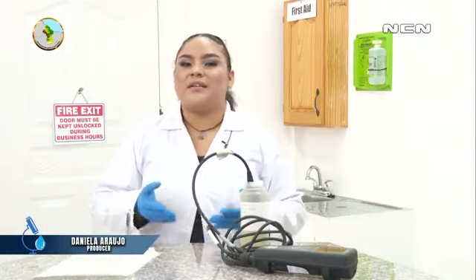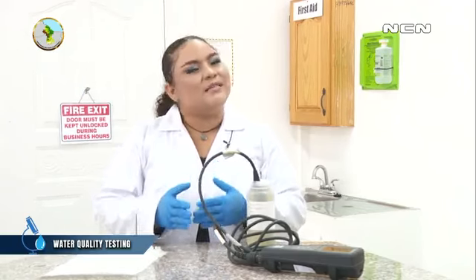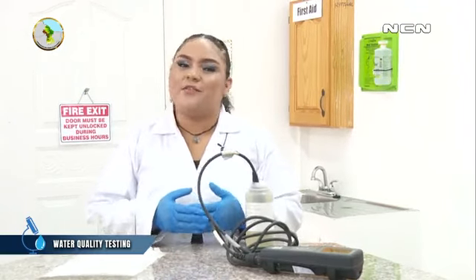Water was collected from a canal on Crowell Street, and the pH and turbidity were tested. It was then determined that this water is not safe for drinking.